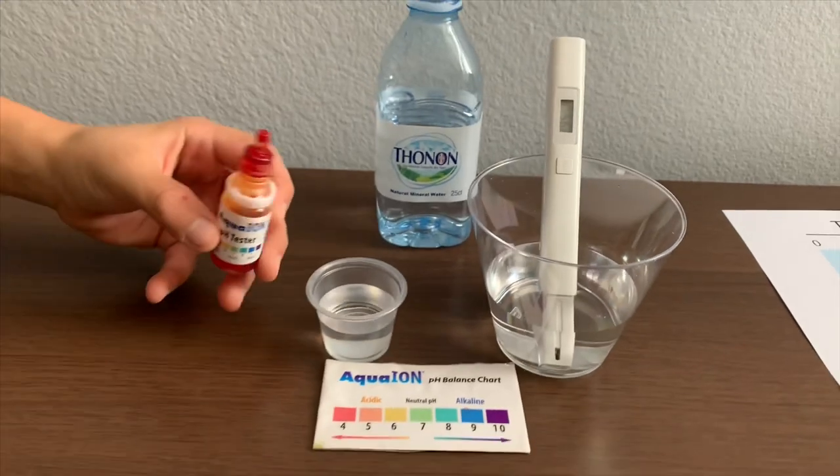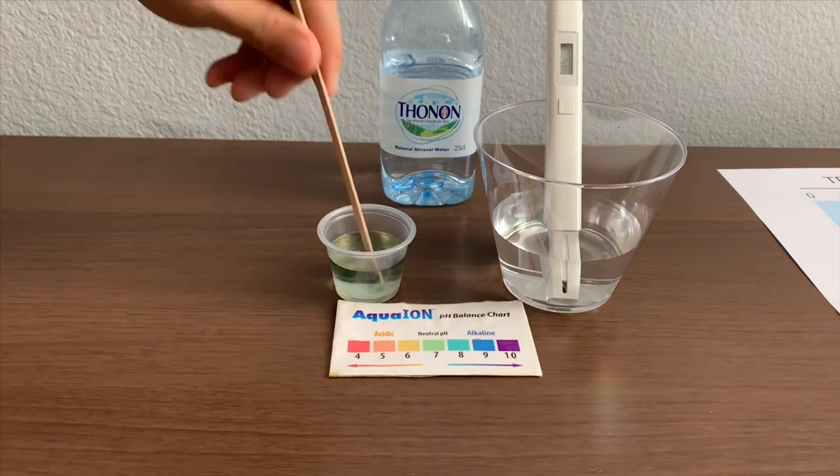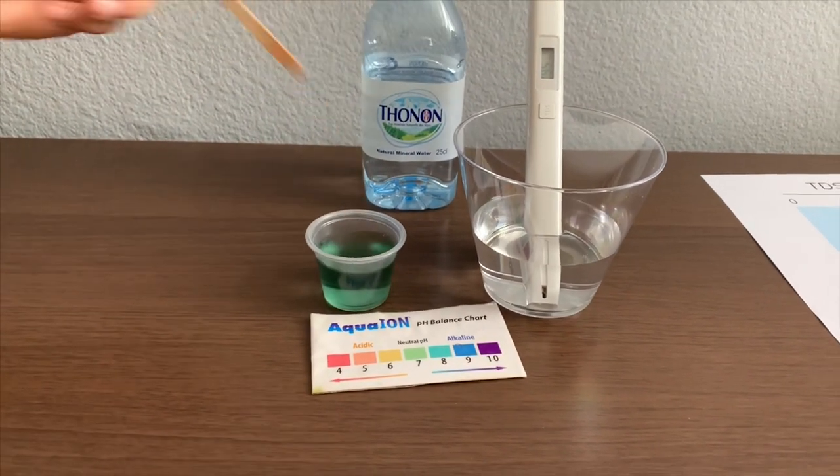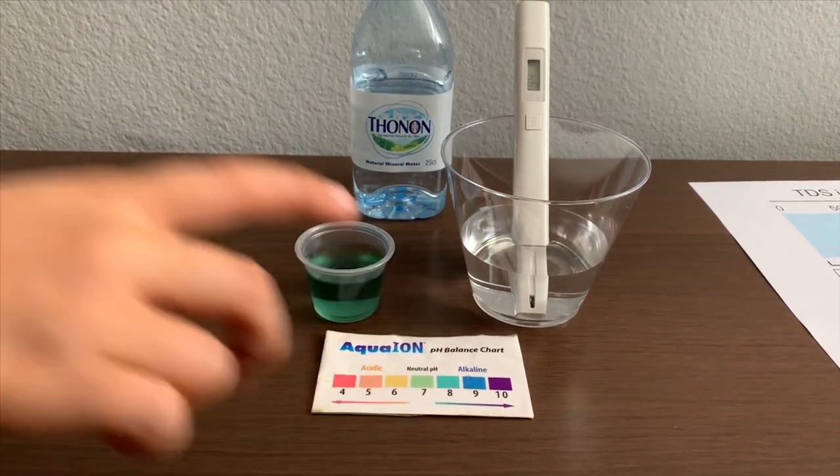Only do two drops. Let's stir it a little for a better result. I give this an eight. This is natural pH.